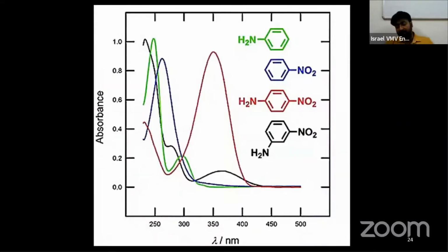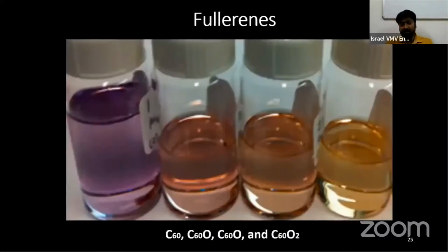Okay, so that is how one should discuss the absorption spectrum of organic molecules. That is how the absorption spectrum of any material is seen conventionally. And what comes next is the absorption in nanomaterials. And here is where we have to write new science. We have to add more information to the conventional technique. We have to understand the spectroscopy in a different way.